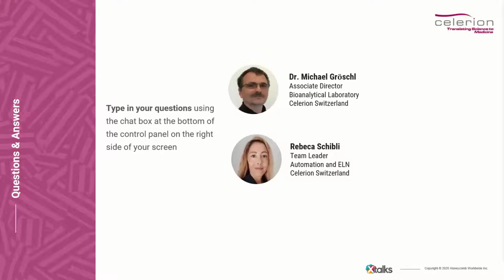That's the challenge: to identify those persons and keep them, and try to also make the system less scary for everyone, more accessible, more user-friendly. So here at Celerion, we try a lot with training sessions, so that they know what we are talking about, so that they don't see the system as something completely strange, but get familiar with it. Nowadays, after so many years, we struggle less than before, but this is a constant challenge. Okay, thank you very much, Rebecca, for that.